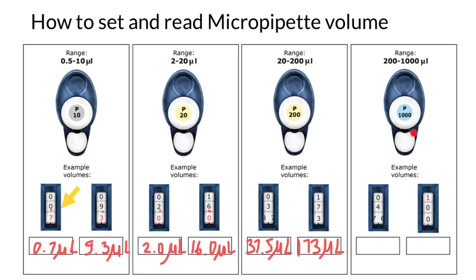On the micropipette P1000, there are also peculiarities how we read these numbers. So the range is between 200 and 1000 microliters, but how do we read this? Is it 46.5, like we had it here, 37.5? No. Here it means 465 microliters.